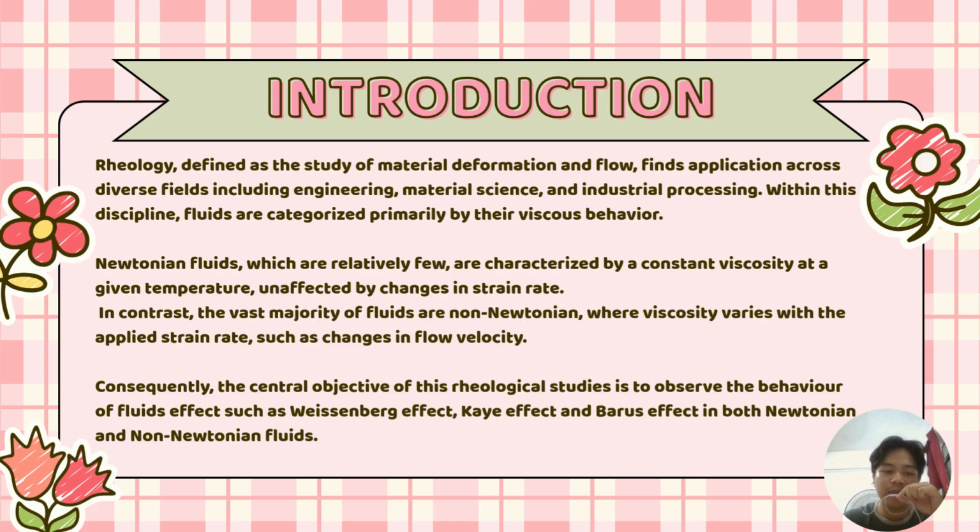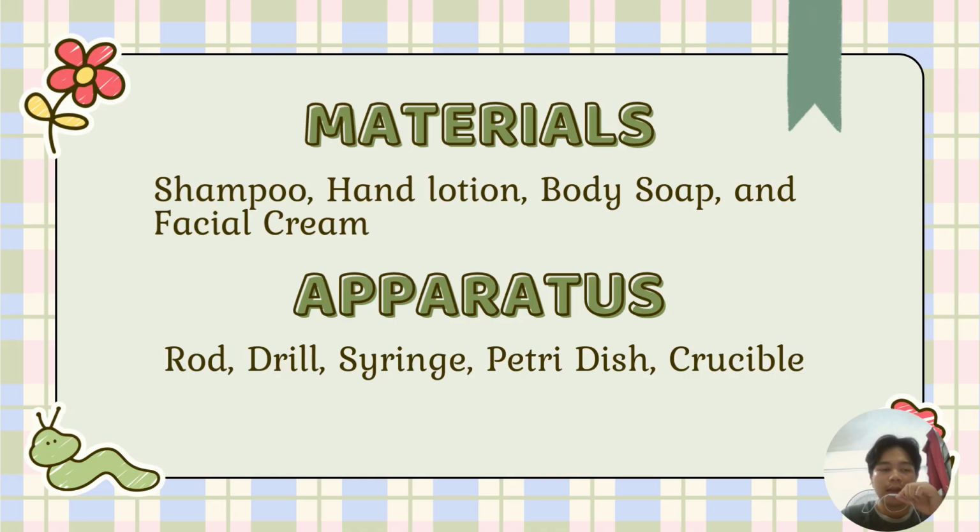Consequently, the central objective of these rheological studies is to observe the behavior of fluids, effects such as Weissenberg effect, Kaye's effect, and Barus effect, in both Newtonian and non-Newtonian fluids. As for the materials used, we chose shampoo, hand lotion, body soap, and facial cream. And for the apparatus, we use rod, drills, syringe, petri dish, and crucible.